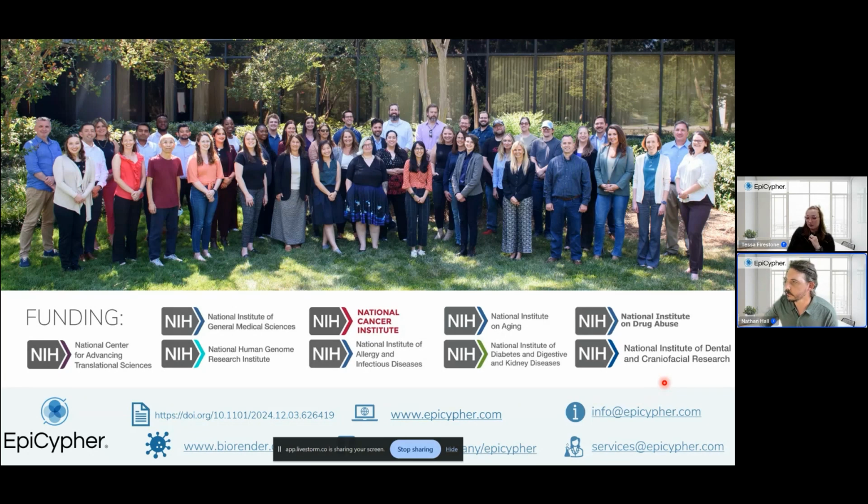Let's see, there's a ton of questions. How common is it to under or over digest? Is that a problem that you've encountered before? If you do the 2 hours at 4C during the actual activation, I don't think you will encounter over digestion or under digestion. But if you were to leave your samples at room temperature, then you can definitely start to see that over digestion occur.